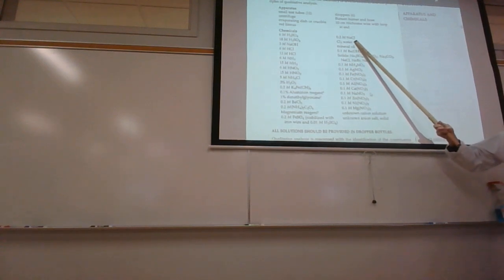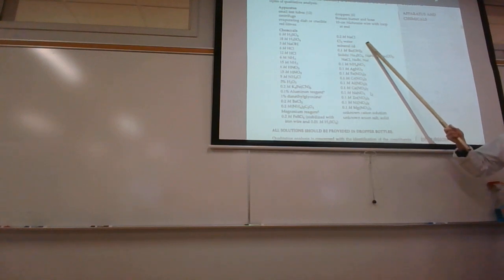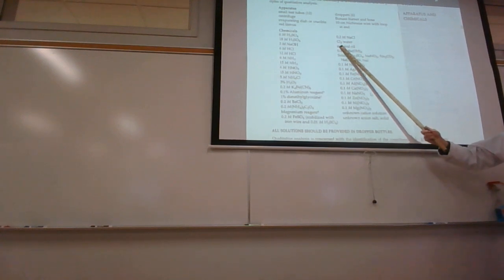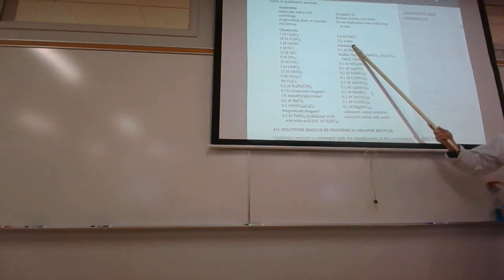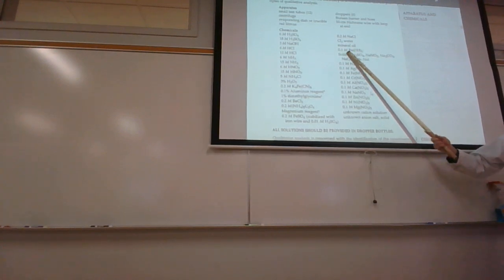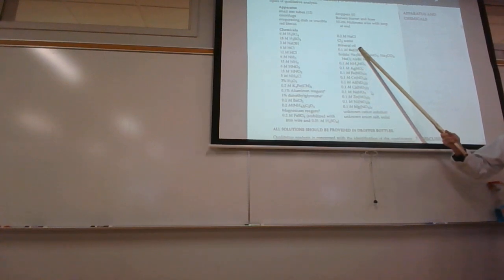Sodium chloride is generally regarded as safe, GRAS. Chlorine water. Chlorine's a powerful oxidizer. This is yellow-green water. Mineral oil. Mineral oil is used for lots of different things.